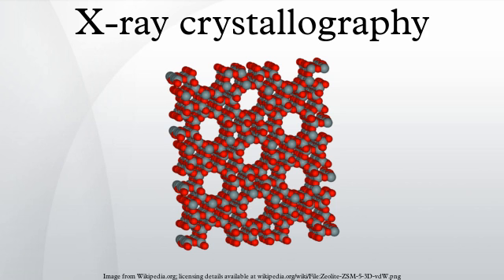Small molecule and macromolecular crystallography differ in the range of possible techniques used to produce diffraction quality crystals. Small molecules generally have few degrees of conformational freedom, and may be crystallized by a wide range of methods, such as chemical vapor deposition and recrystallization. By contrast, macromolecules generally have many degrees of freedom and their crystallization must be carried out to maintain a stable structure. For example, proteins and larger RNA molecules cannot be crystallized if their tertiary structure has been unfolded. Therefore, the range of crystallization conditions is restricted to solution conditions in which such molecules remain folded.